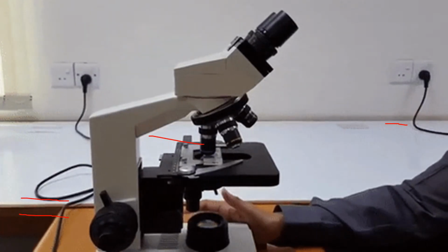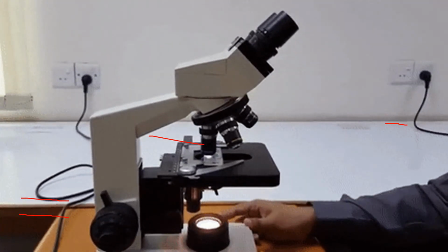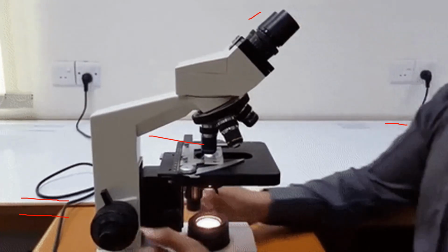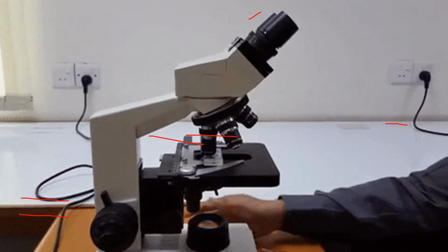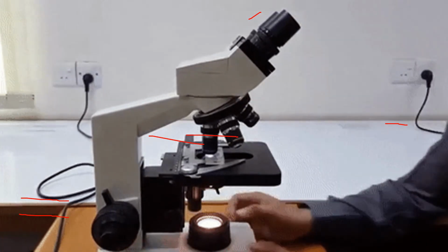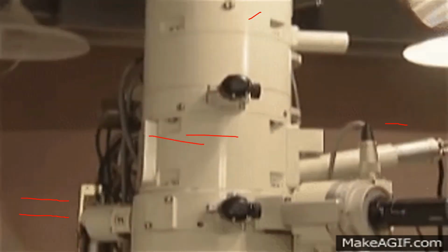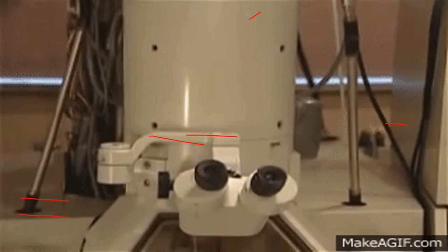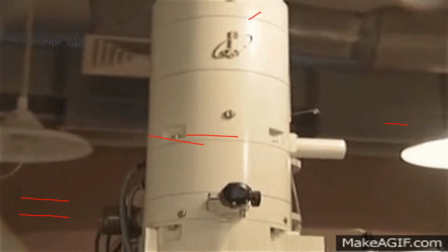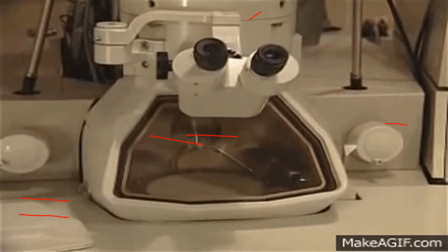Another example is the compound microscope. The reason why tinatawag siyang compound microscope kasi dalawa yung lenses niya. Yung una is of course dito, yung sa eyepiece, and a combination with the magnification dito sa kanyang mga objectives. So pag-aaralan natin mamaya yan, especially sa computing for the magnification. And the last type of microscope is the electron microscope, na instead of lenses, gumagamit na siya ngayon ng mga electrons in order to enlarge an image.